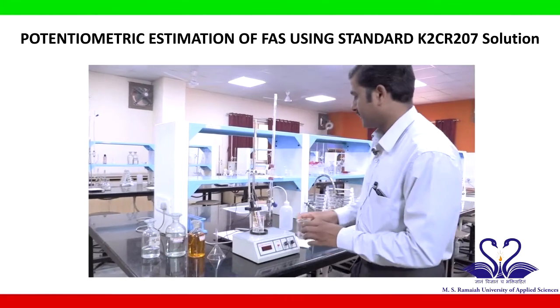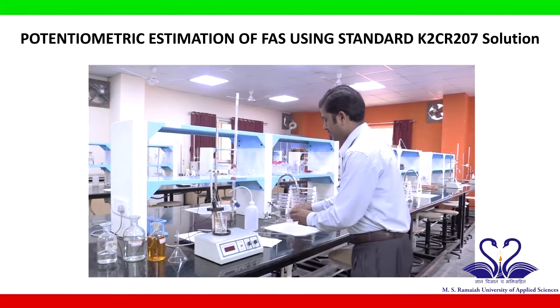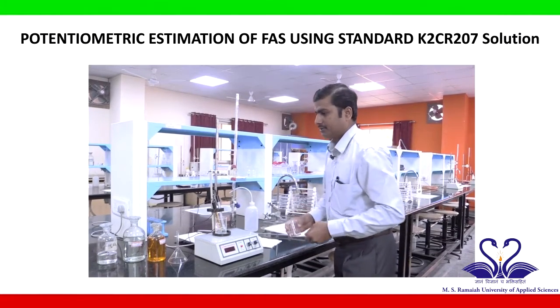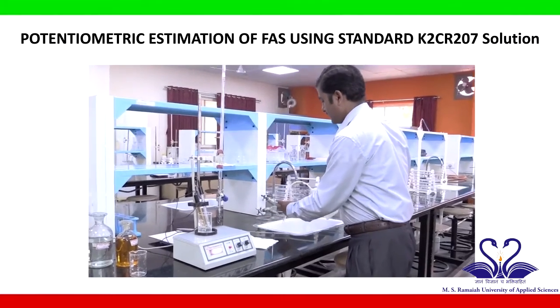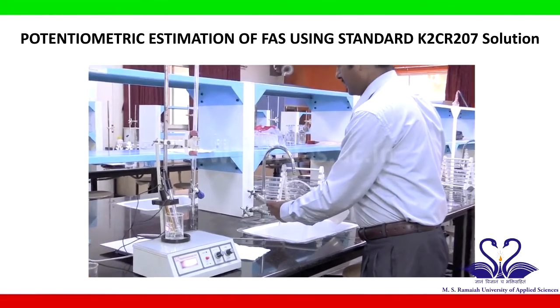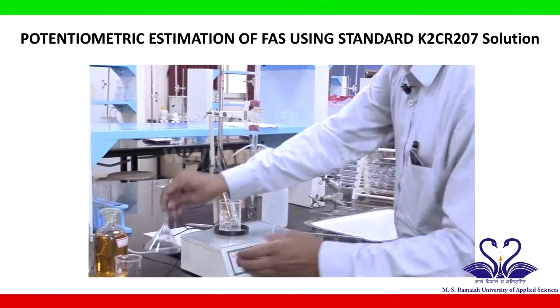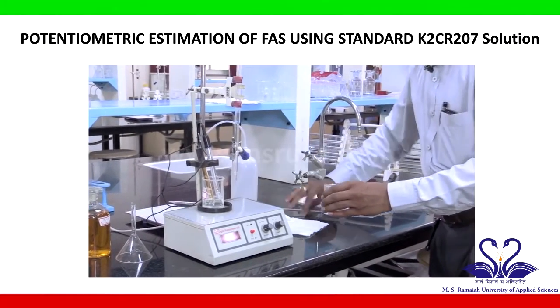So let us clean the beaker. Funnel. And the pipette needs to be cleaned.